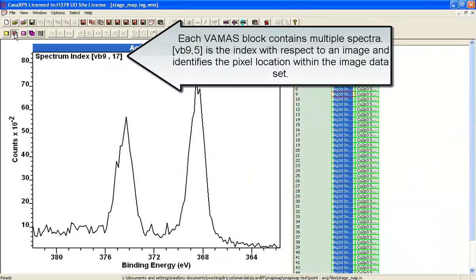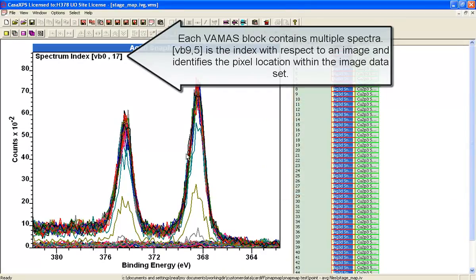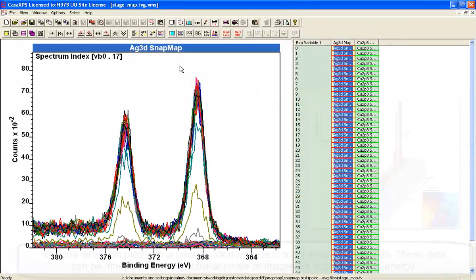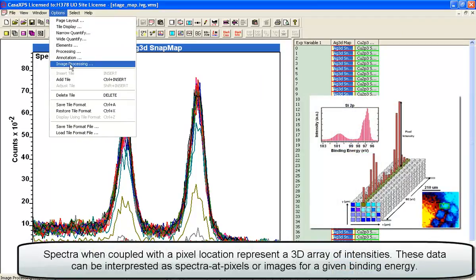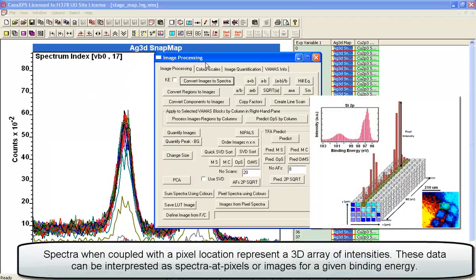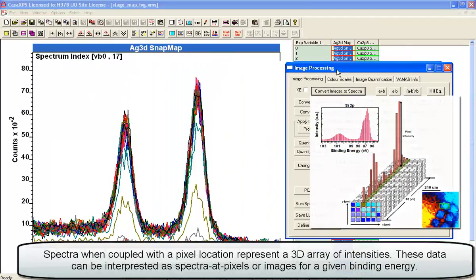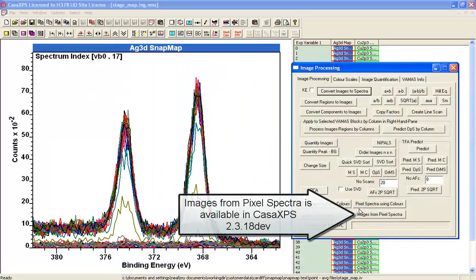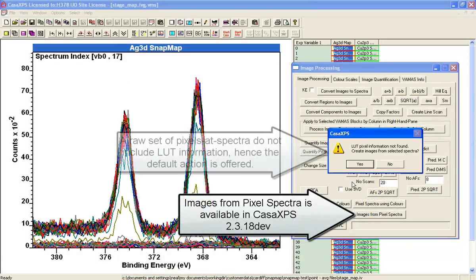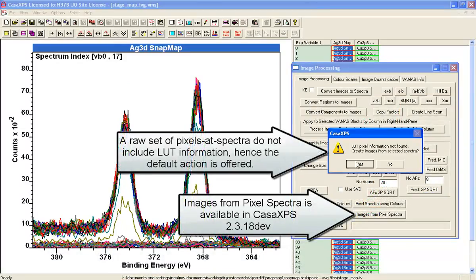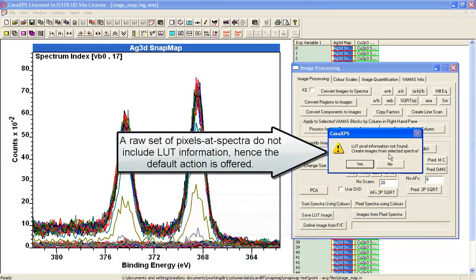Although these are spectra pixels, we can convert these to images using an option on the image processing dialog window, and this image from pixel spectra will use the selected spectra here in the right hand side.